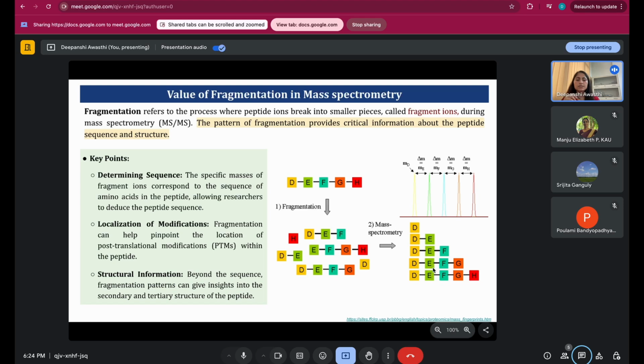So in that way you can distinguish, because on the right-hand side, the peptide corresponding to the complete peptide used in the experiment will have the highest mass-to-charge ratio. This ratio gives you an idea of the length of the peptide, and helps you distinguish between different peptides. By comparing all these peptide sequences and their mass-to-charge ratios, and taking the difference among consecutive mass peaks, we can identify which amino acid is present.